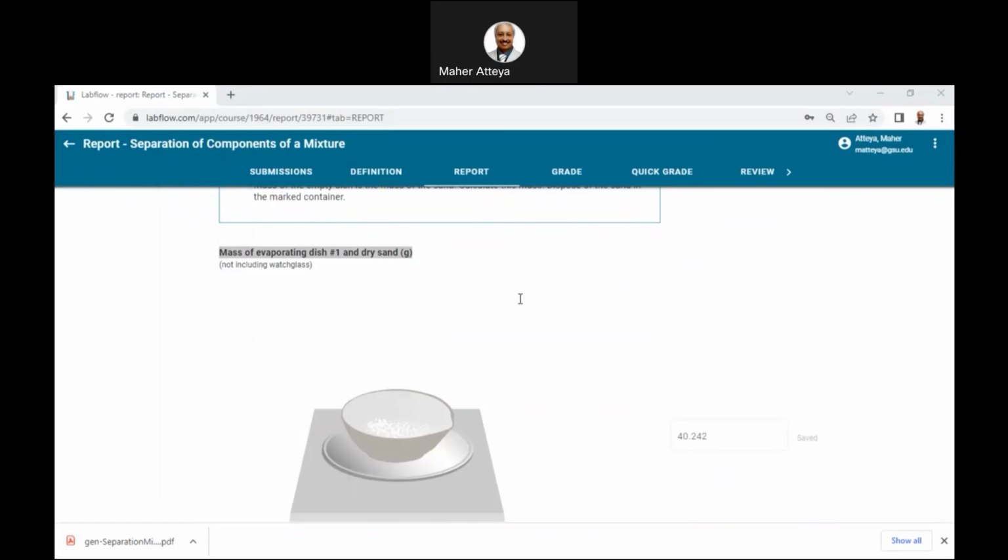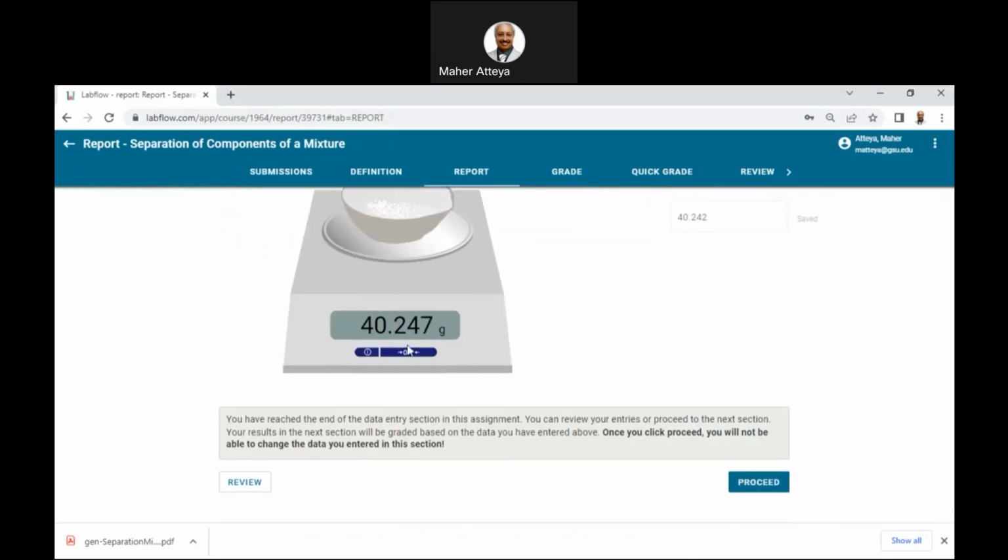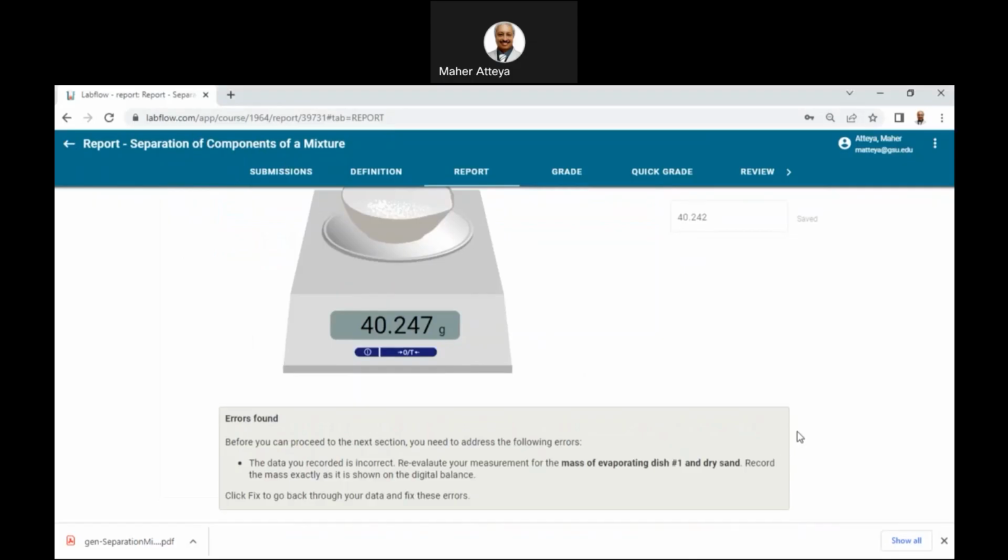So here we are. Let's proceed and see if the error is fixed or not. I'm not sure what's wrong. 42, proceed. Error found.